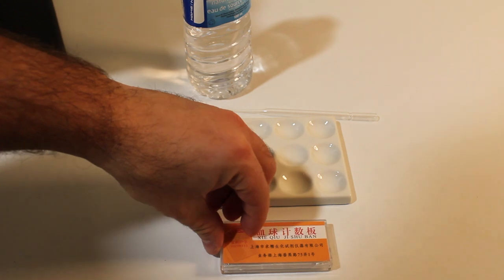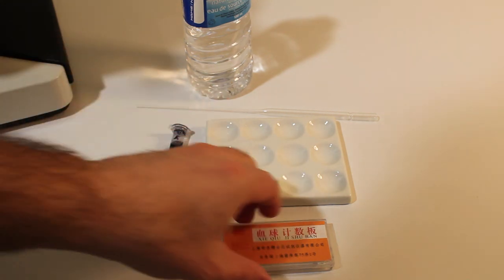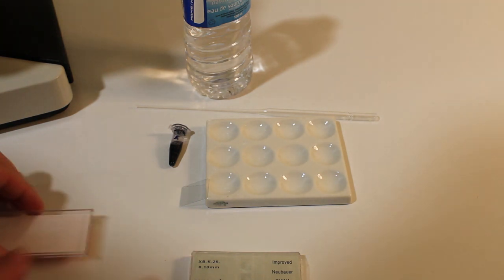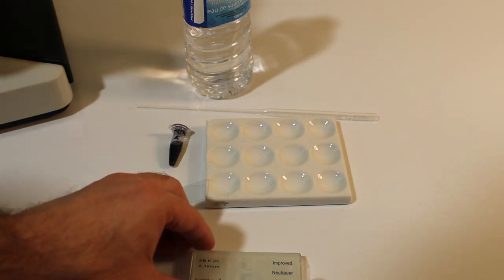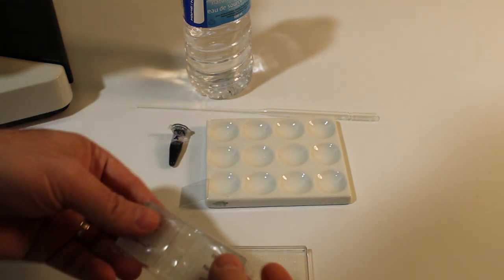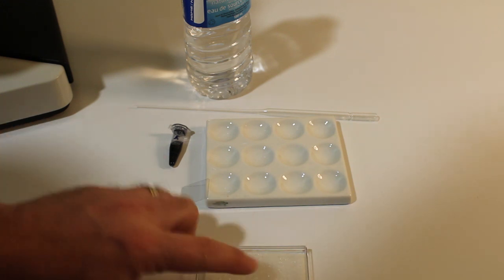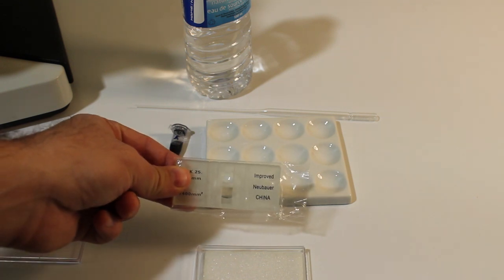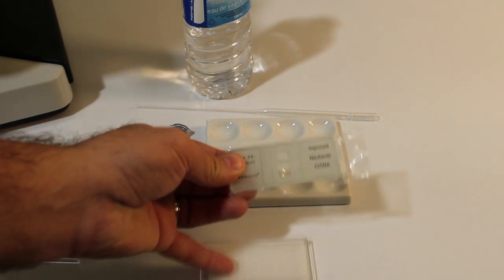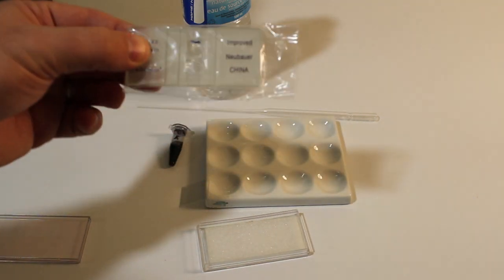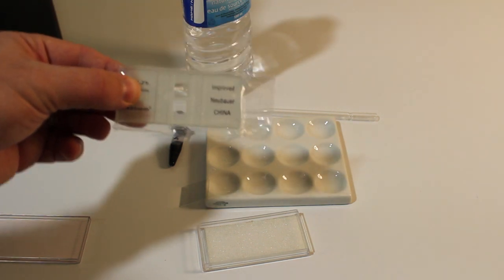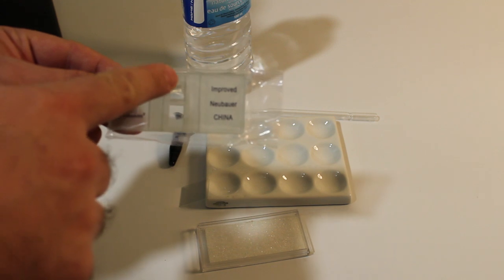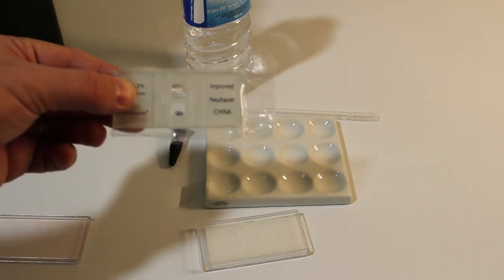Now I just want to show you quickly the hemocytometer in its case. Even though this unit is relatively cheap they've taken some effort to pack this properly. You'll notice the hemocytometer itself is in a plastic storage bag with a foam base to help protect it. And it's really important when you're storing these things that you do keep them in their case with the foam padding, and I recommend keeping them in their plastic bag as well. This will just help to protect that glass surface where the counting grid is from being accidentally scratched or damaged.